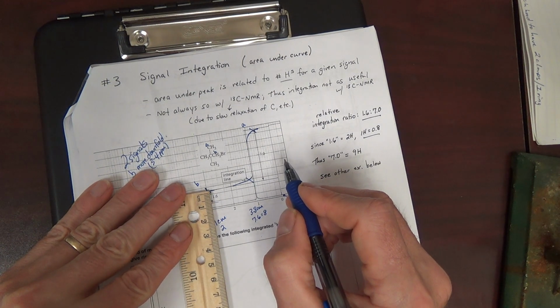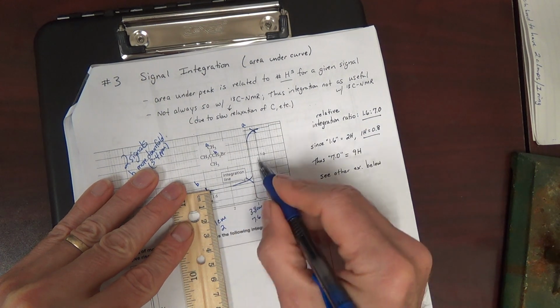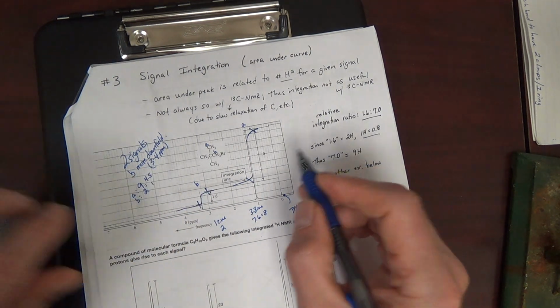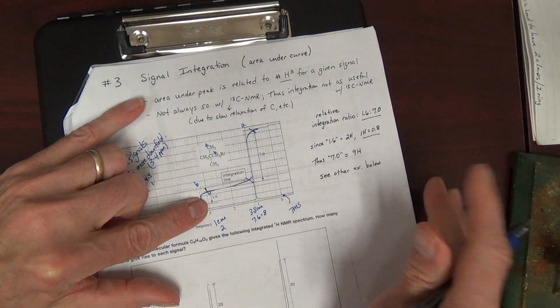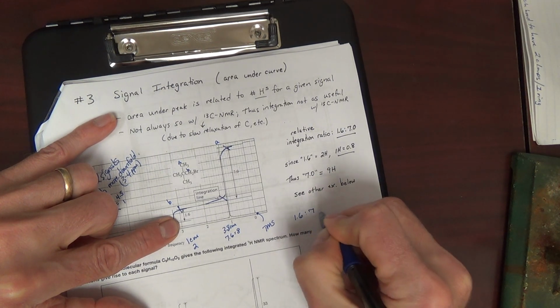That's just a computer-generated number, almost unitless. Relative numbers. It's not 1.6 centimeters. But these numbers are basically your integration. And it's giving me a 1.6 to 7 ratio.